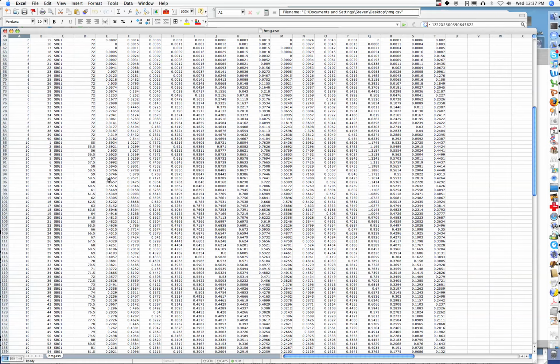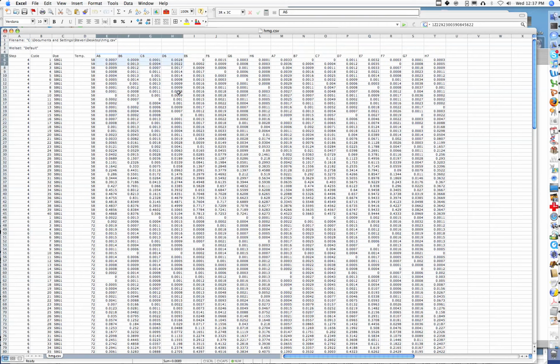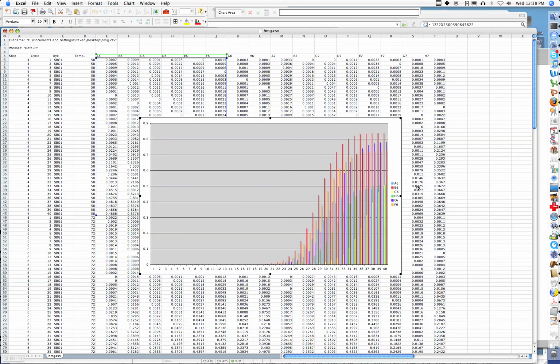And this is the melting curve down here. So it takes two reads, one at the annealing, one at the extension, and it should look something like this. And that way you know the data is correct.